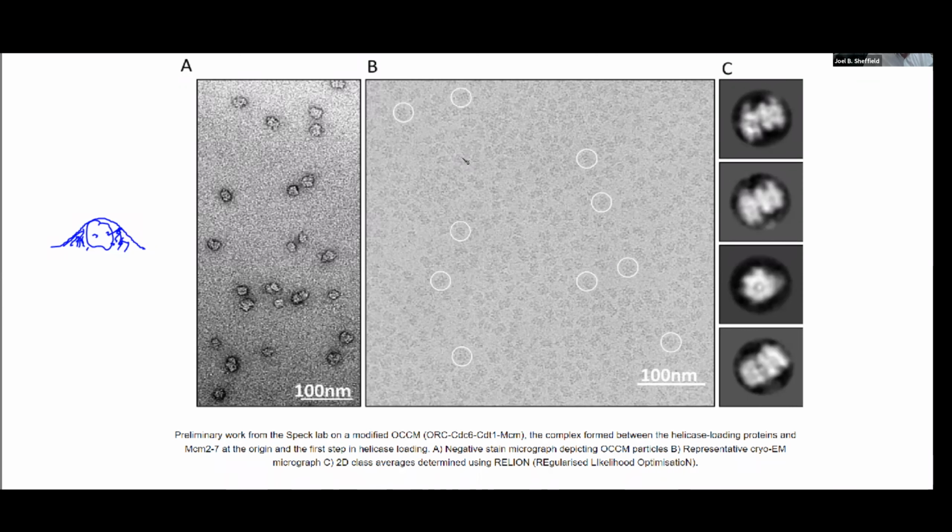In this cryo-EM image, that same protein is simply frozen. It's in a thin layer. And you can barely make out the structure. So by using this slight bit of underfocus, by using the more elaborate cameras, it's possible to collect these images, vague though they may be.